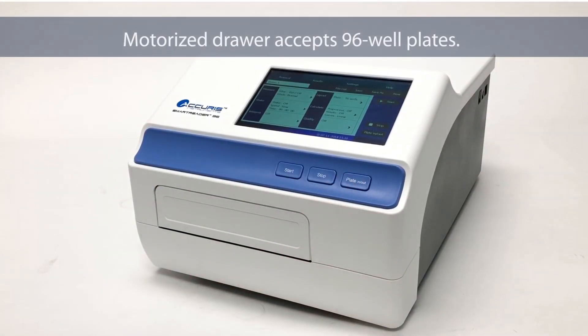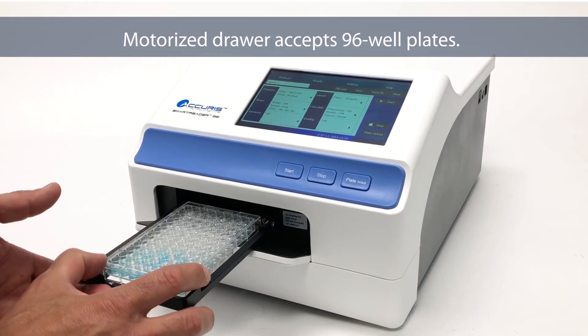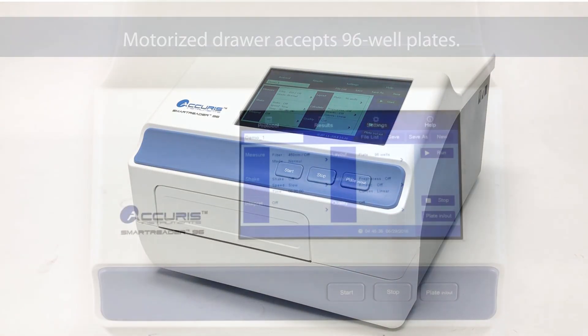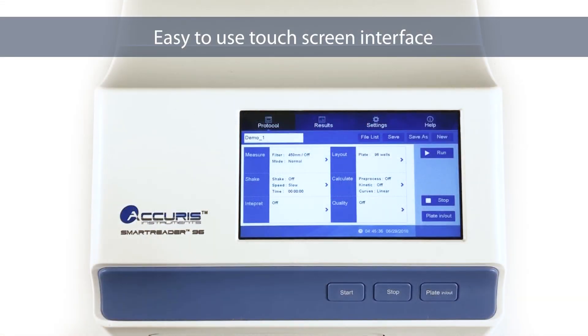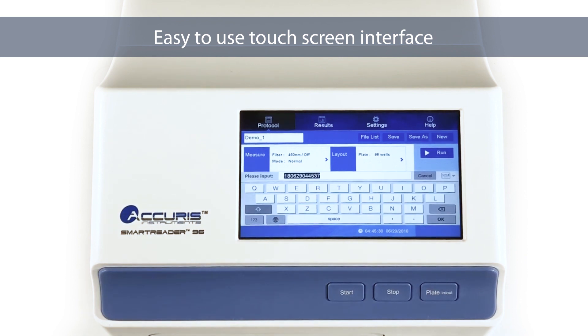The motorized drawer is quick and easy to operate and accepts 96-well ELISA plates. A large color touchscreen on the front panel simplifies programming and operation. A new program is easily created and named with a pop-up keyboard window.